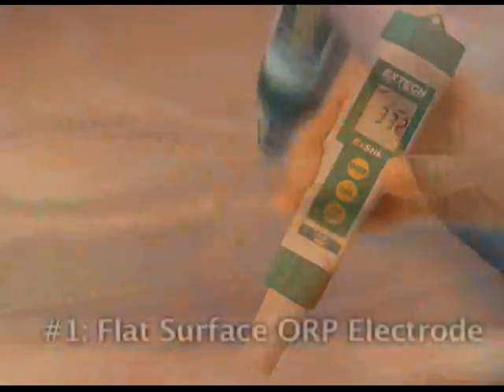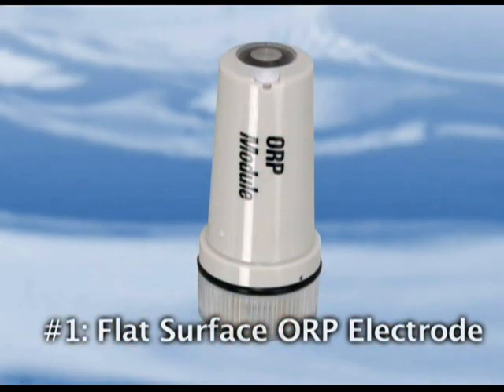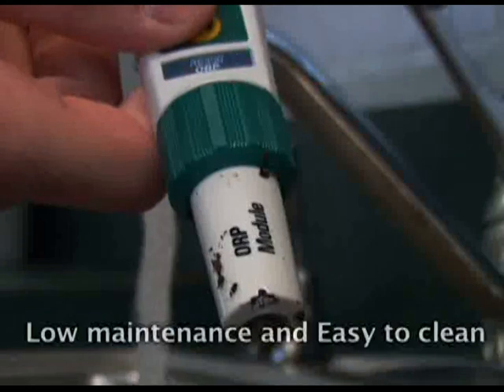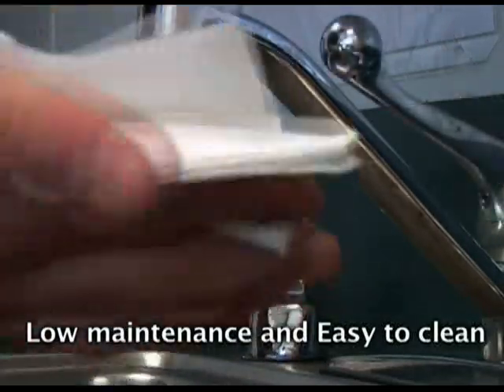1. The rugged, flat surface ORP electrode can withstand rough handling compared to the standard glass bulb electrode. Its functional design offers low maintenance and is easy to clean without having to worry about clogged junctions. To clean, simply rinse the tip with tap water and dry off with a soft cloth or paper towel.